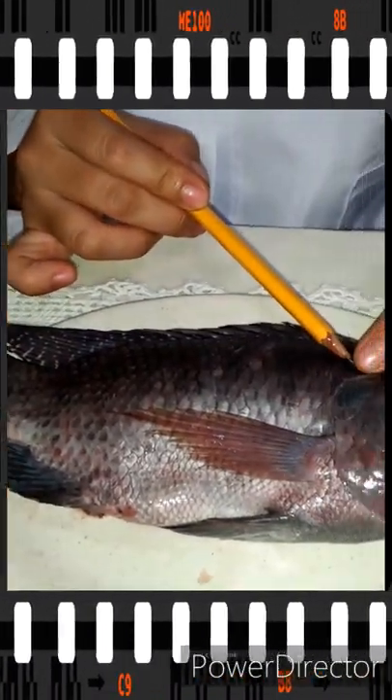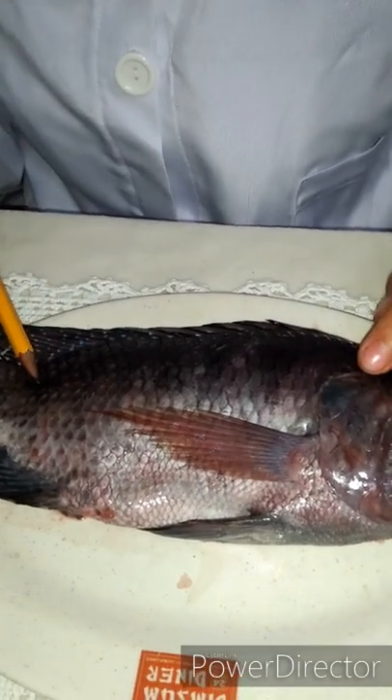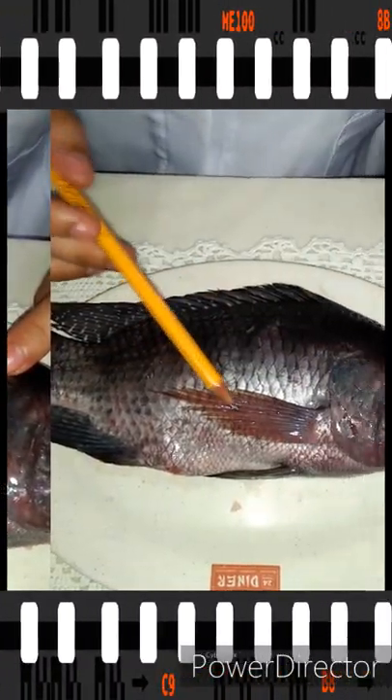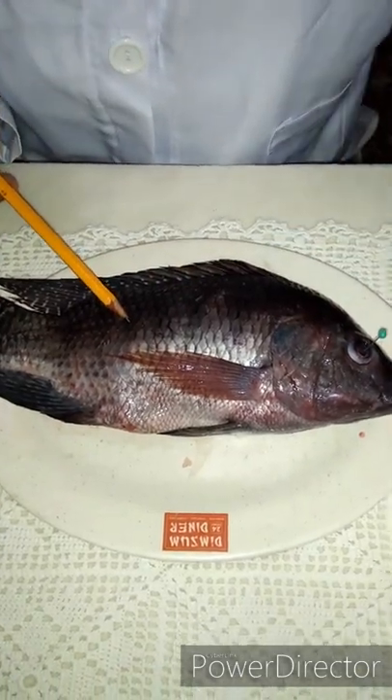It also has an operculum, which is a flexible bony plate that protects the sensitive gills — this one is the operculum. This is the lateral line of the fish; it is the sensory organ used to sense water currents and pressure movements in the water.